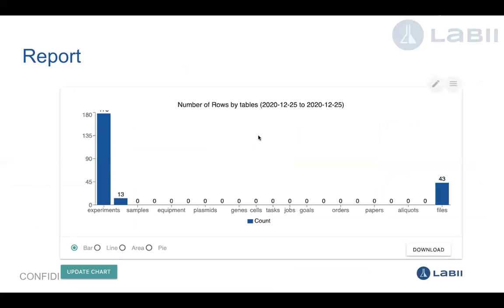And you can also generate a report. Actually, this report is very sophisticated. It's also one of the widgets. You can report based on different tables, like over here, just like the example showed you, or based on different projects, different persons, different time ranges. You can just see the result based on a row count, or just want to see the result based on one particular column. You can average it, summarize it. So all that can be done with this one single widget. So all the reports can be generated inside the system.